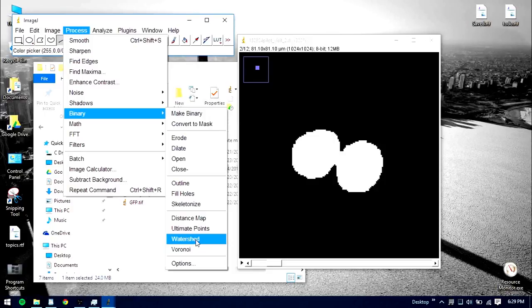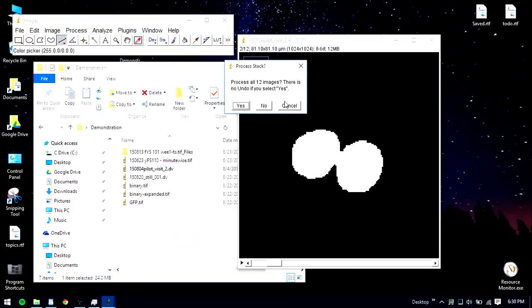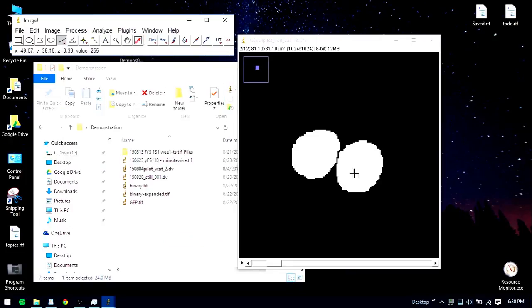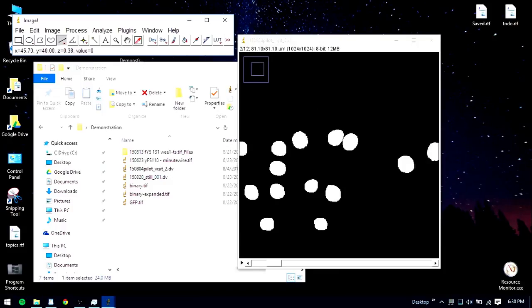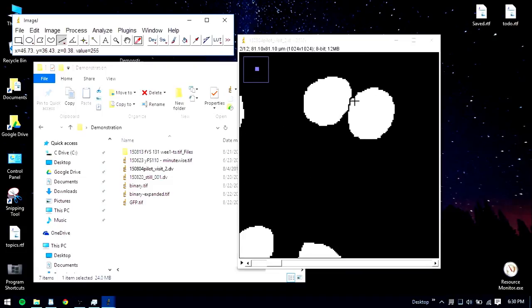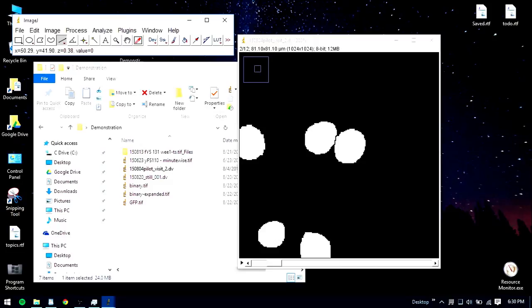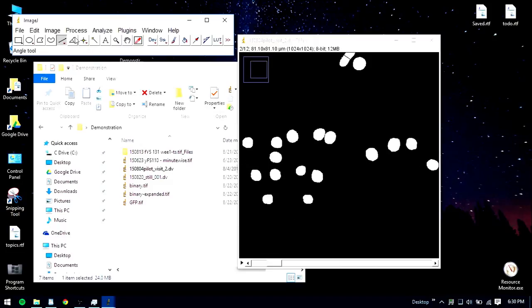And you can Wikipedia it for a better visualization, but I'm going to click on it, and it essentially just does this, where it segments things that it detects are close together but aren't the same thing. And this is useful for if you're trying to keep track of individual cells, especially with a resolution that makes it hard to get a good focus on it. And there are also a couple of other algorithms that you can play around with.